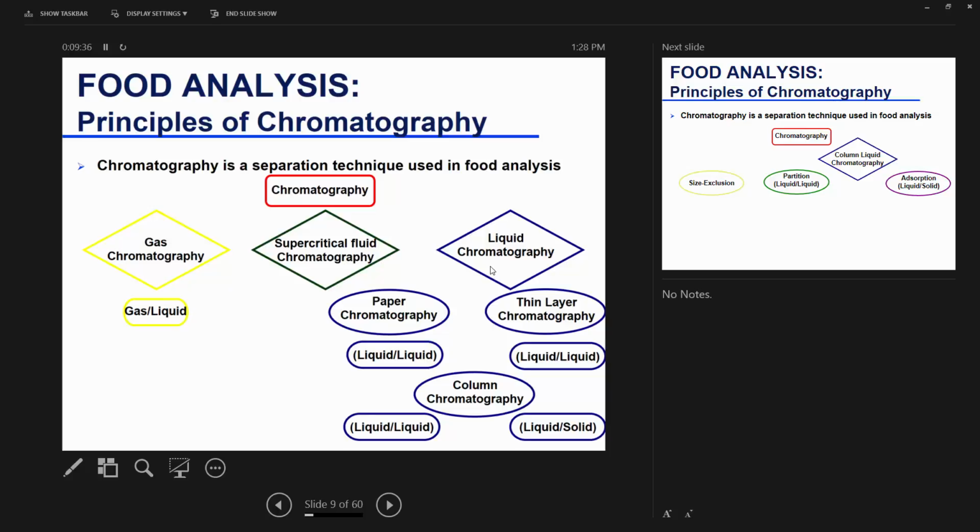So nowadays, in gas chromatography, your stationary phase is basically a capillary tube. Your column is a capillary tube column. That means hollow in the middle. And then you have a support lining within that column. And then you have a bonded liquid phase. The bonded liquid phase is your stationary phase. And then the gas, you have a carrier gas, is your mobile phase.